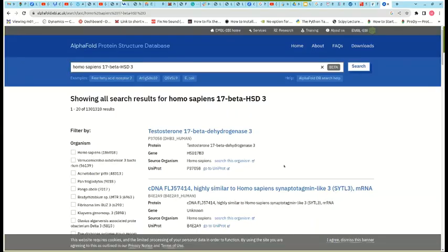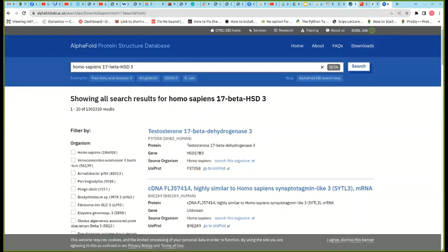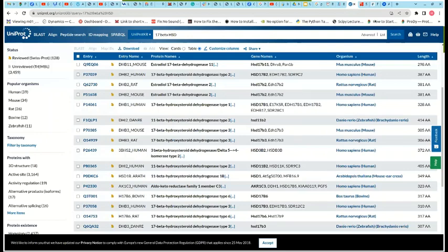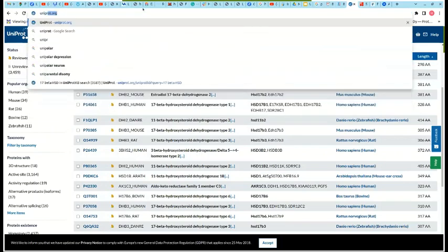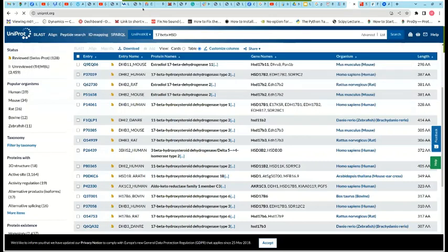Okay, because of time, I already opened those tabs on my browser, so I'll just start all over again so that we can see. So directly, you could just type UniProt. I know you've done some jobs on UniProt prior now.